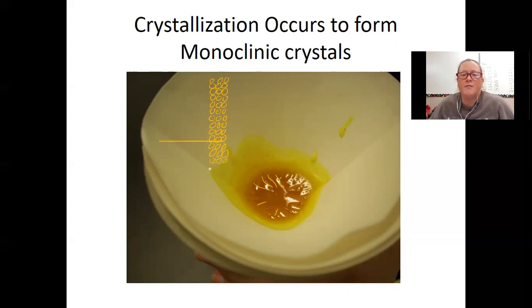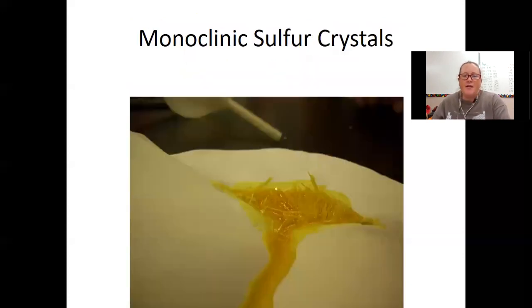They're rigid, they're stuck in place, they're still rings, and maybe eventually we kind of come to a point. Okay, so this is the monoclinic allotrope of sulfur. All right, and here are some beautiful needle-like crystals in which those molecules are arranged in rows.